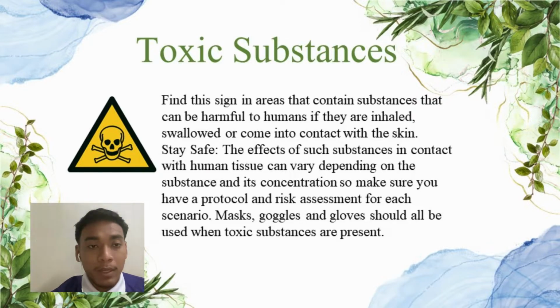The effect of such substances in contact with human tissue can vary depending on the substance and its concentration, so make sure you have a protocol and risk assessment for each scenario. Masks, goggles, and gloves should be used when toxic substances are present.